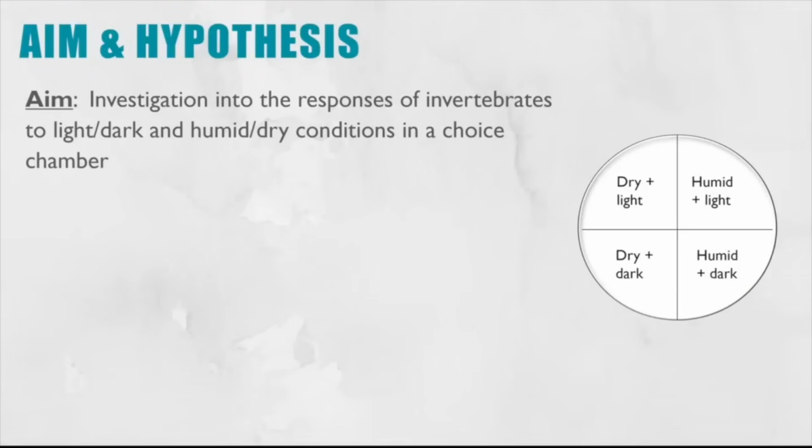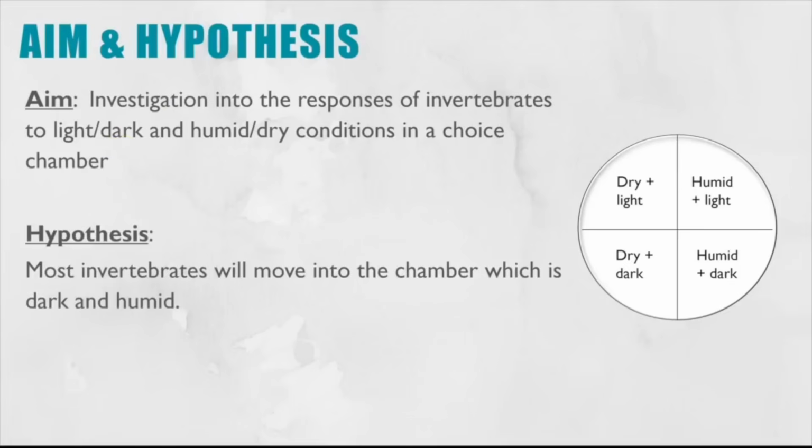So the aim is what we're trying to investigate, and we're investigating the response of invertebrates to light and dark conditions and humid and dry conditions. The hypothesis is what you predict will happen. So I'm going to predict that most of the invertebrates will move into a chamber within the choice chamber, which has the conditions of being dark and humid, because those are more favourable for survival. And we'll go through why at the end of the video in the exam questions.